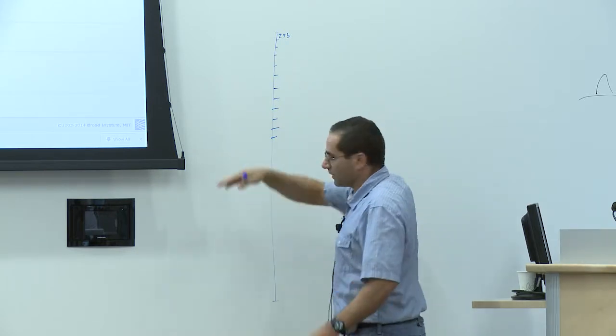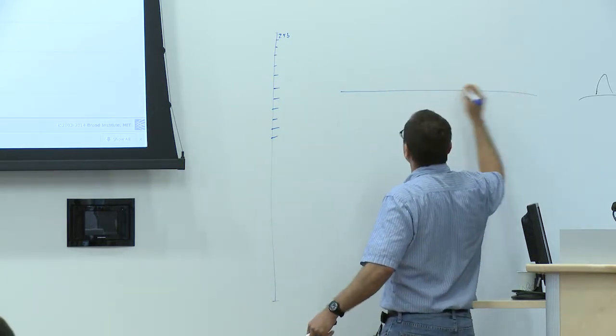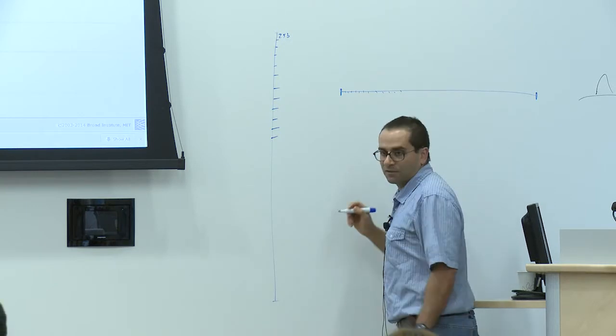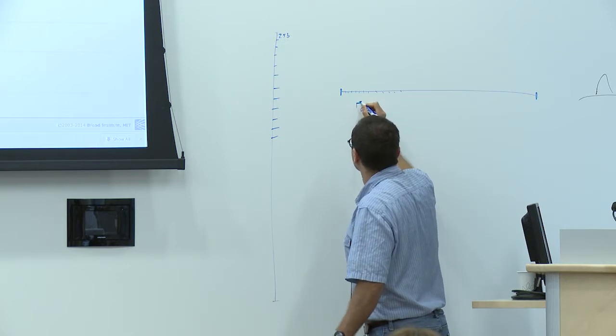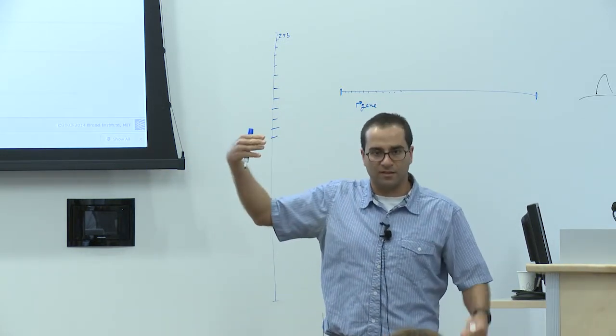So instead of taking the chromosome, I can just flip the chromosome now. Let's say this is the beginning and this is the end of the chromosome. And again, we have many, many bins here. And let's say that we have a gene here, and that's its promoter, or the way we use it here is the TSS, the transcription start site.